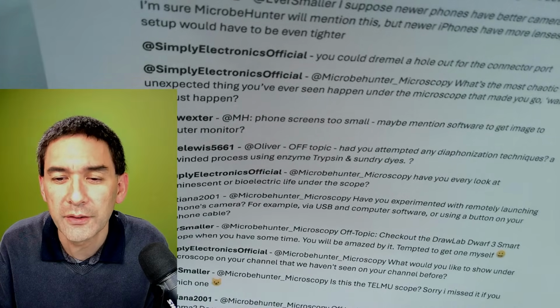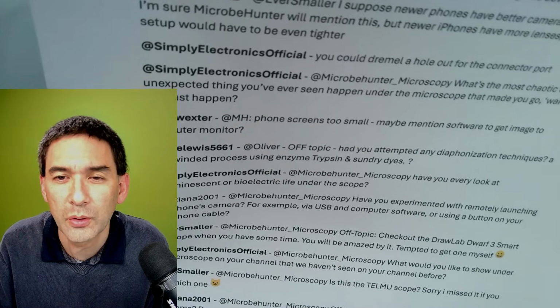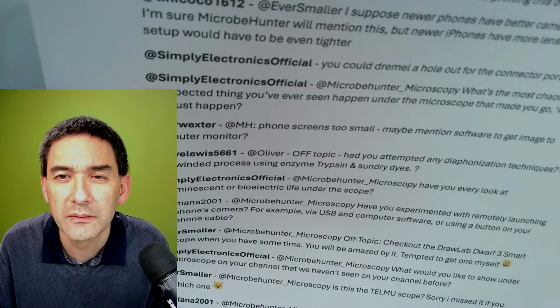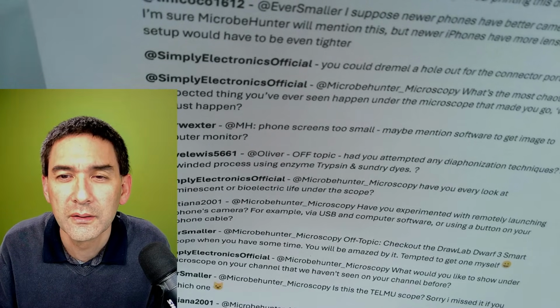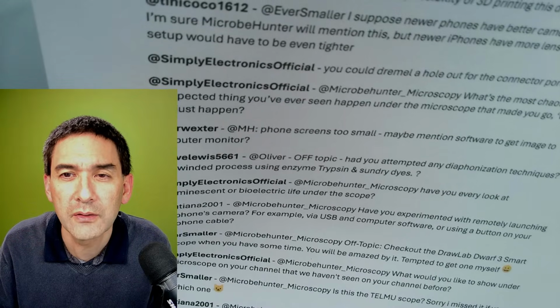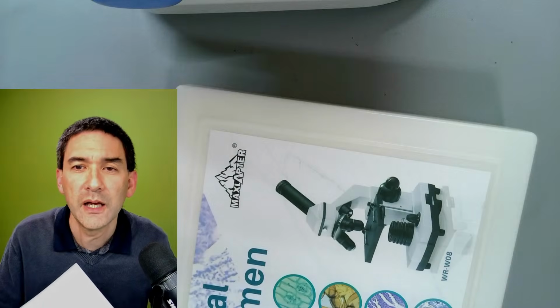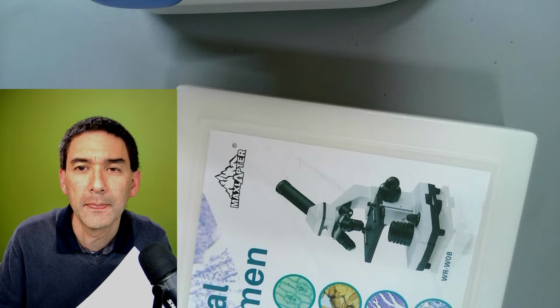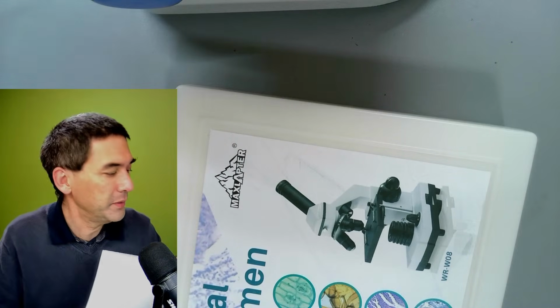If there are any other comments, otherwise I'm going to call it a day today. Okay. Regular scope, so no questions. I hope I didn't overlook anything. Have a full DIC prism set. I plan to design my own custom scope.